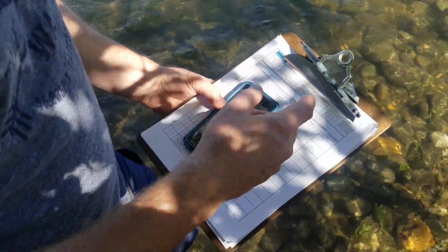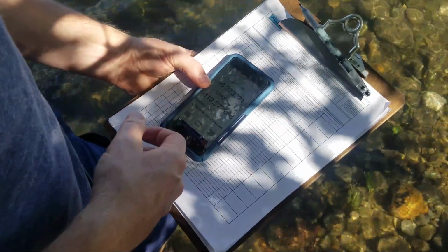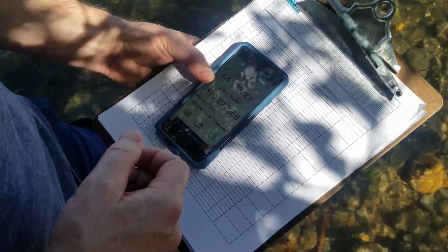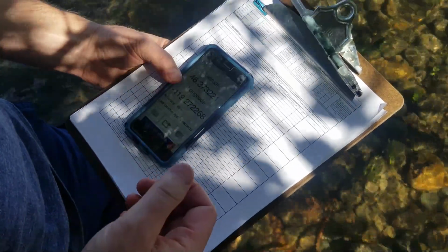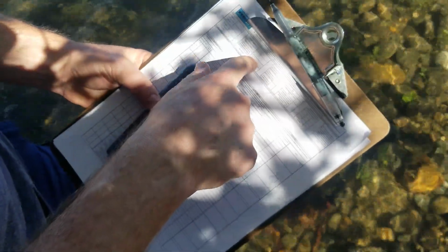After you've recorded the distances between your push points, you want to get your GPS coordinates. Here we're just using an iPhone with the app My GPS Coordinates. You could use normal GPS or other methods. You want to record in decimal degrees here on the hard copy data sheet.